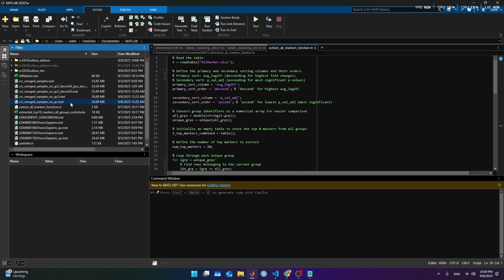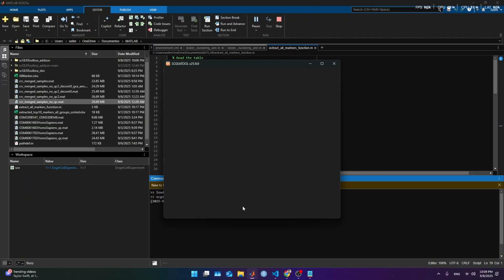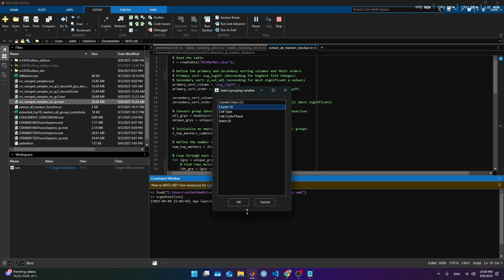We are gonna locate our sample previously utilized. We're gonna open that, load it, and just let it be. It's gonna take a few seconds, and we get this. Then remember we had these many clusters before. I think it's a little different. Let me update.